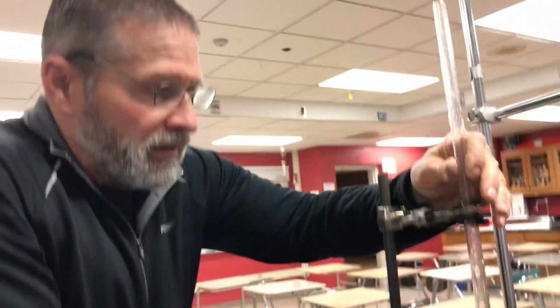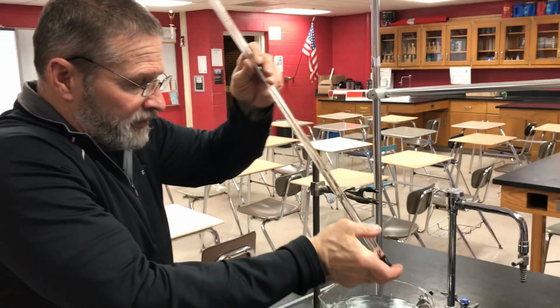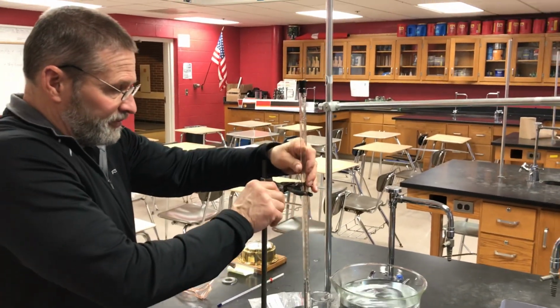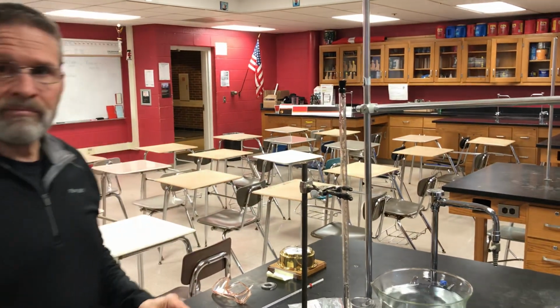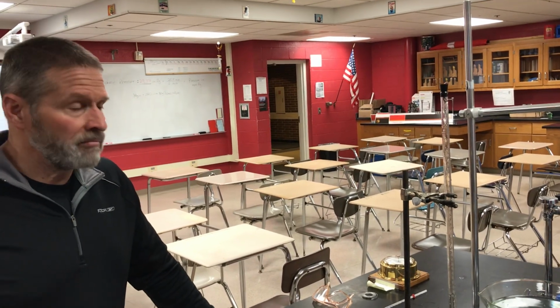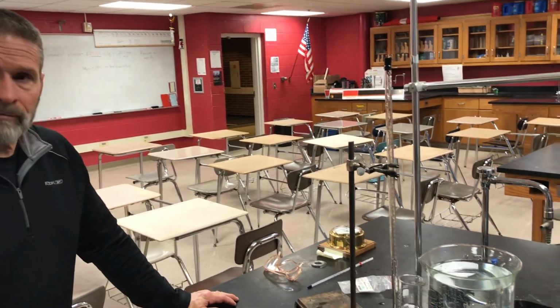Now, Mr. Hevel, did we do this procedure at standard temperature and pressure? Well, no, we certainly didn't. We're not at standard temperature. Our pressure is not standard either, because the gas was collected over water, so the hydrogen was not at standard pressure. So I think that in our calculations, we are going to have to correct the volume that we collected to figure out what it would be at STP, so that we can compare it to the theoretical, which we assume is at STP. We can do that.